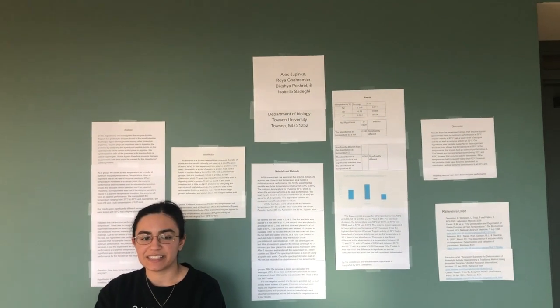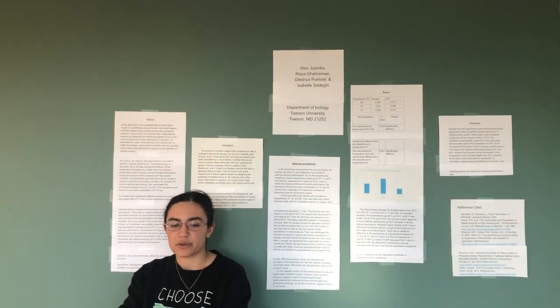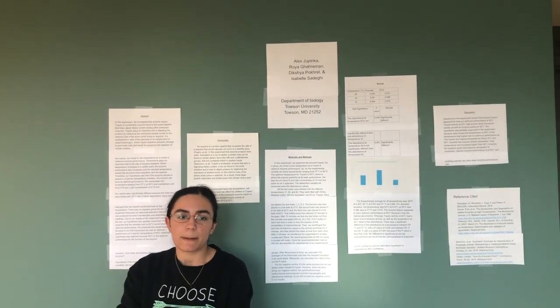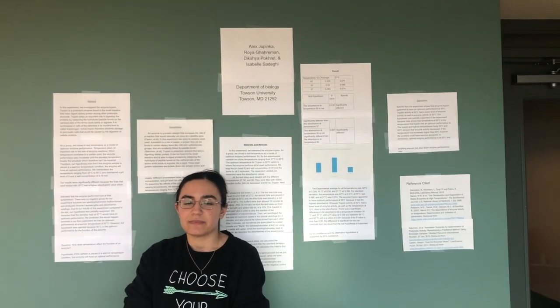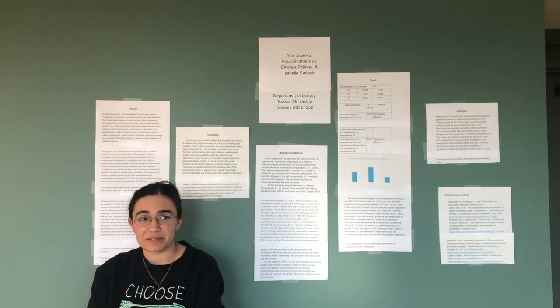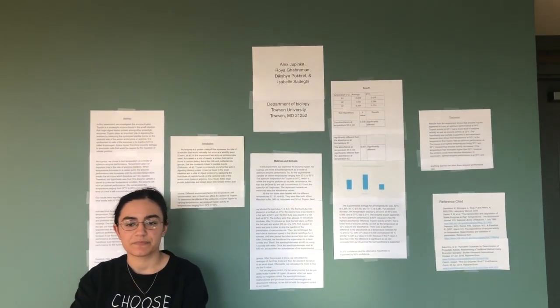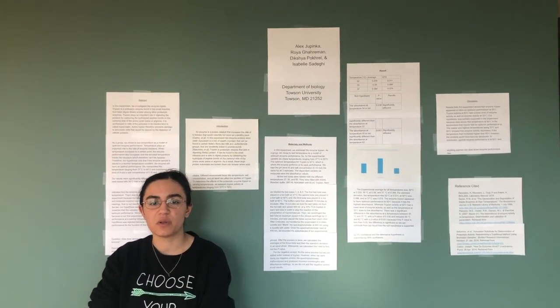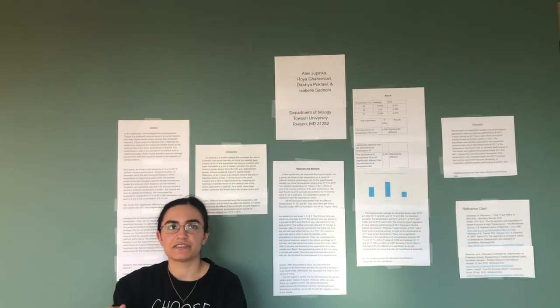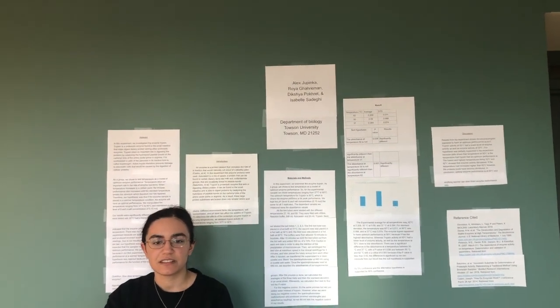And so basically, the enzyme that we've chosen to catalyze is trypsin. And trypsin is used to break down azocasein. The role of trypsin in organisms is pretty much that it just digests dietary proteins. That's really what it does.